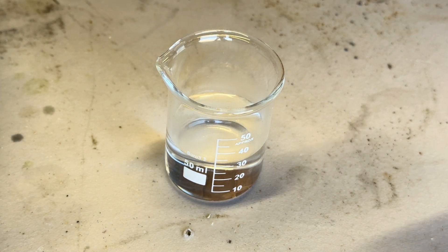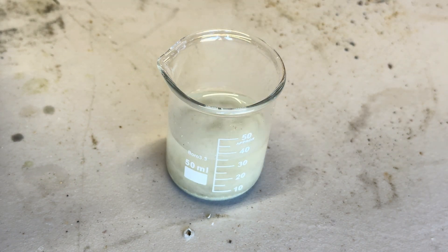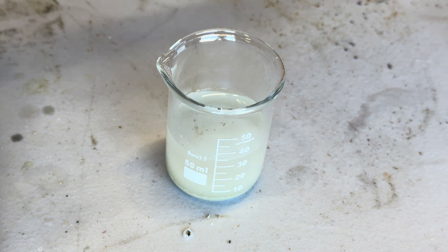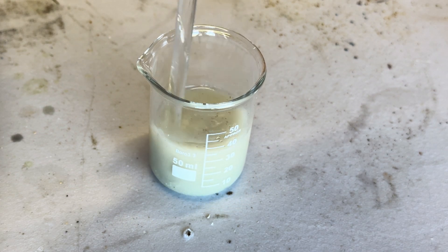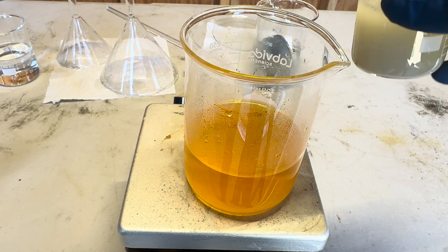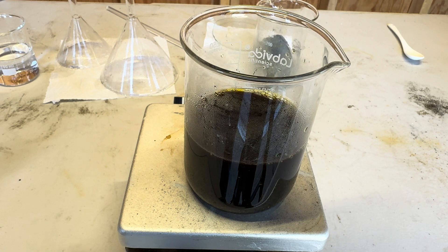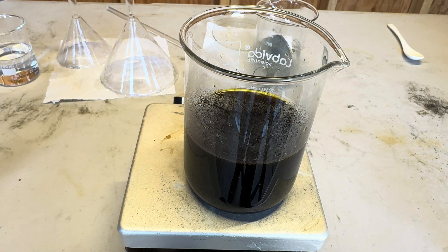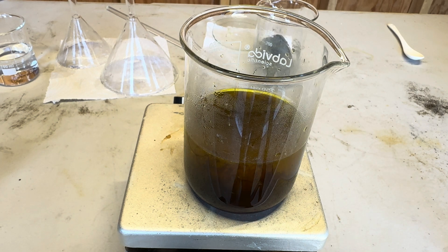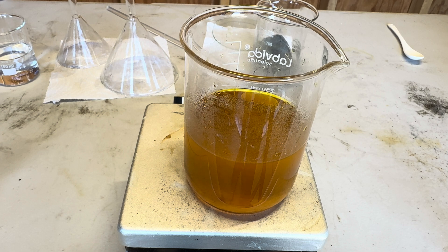We are going to mix up some iron sulfate and water and pour it into our aqua regia solution. If it turns brown, it means that there is gold inside the solution. It looks like we have a favorable result — the dark color indicates gold shall precipitate back out of the aqua regia. Our solution seems to look pretty cloudy right now. I'm not sure if that's normal, but this is what we got.